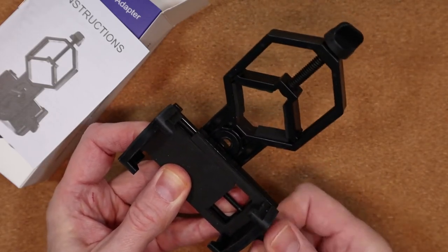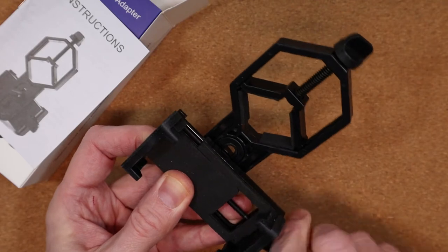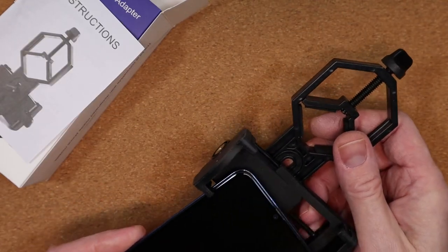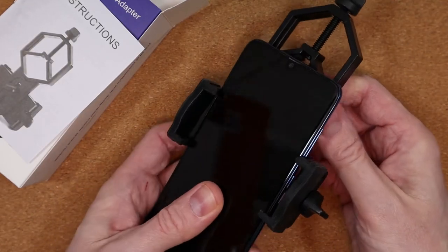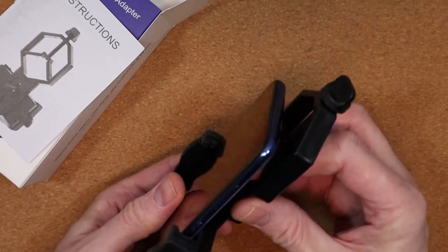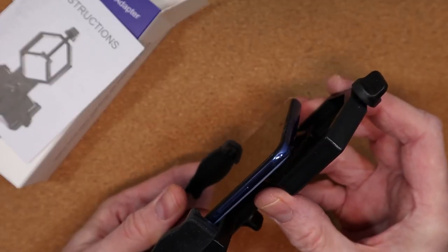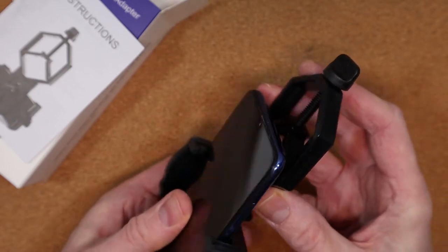The important thing here is to avoid clamping any buttons on the side of the phone. Once that's done, insert the phone and tighten up the clamp so that it's held securely. The last thing you want is for your phone to fall out when you're adjusting the controls of your microscope. That's going to hurt.